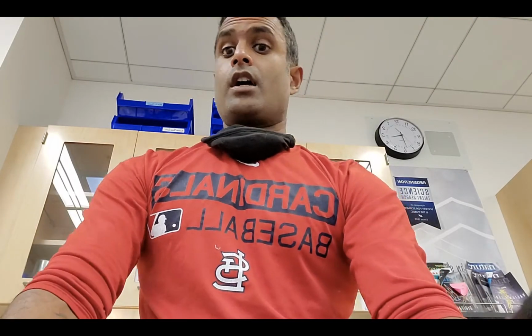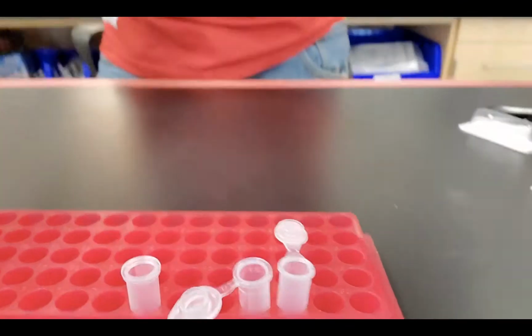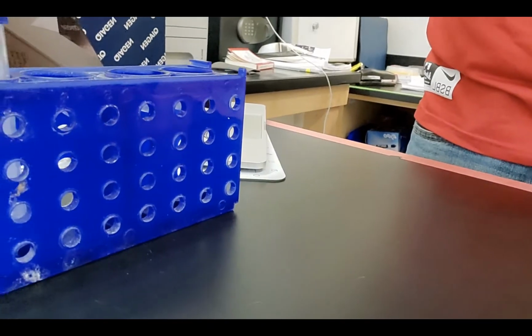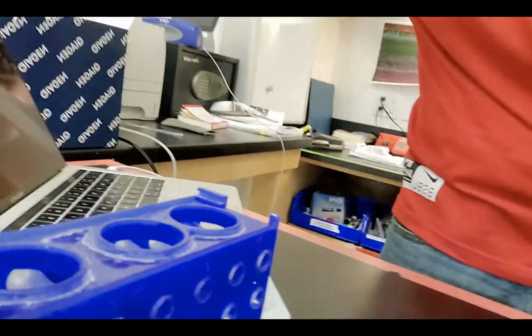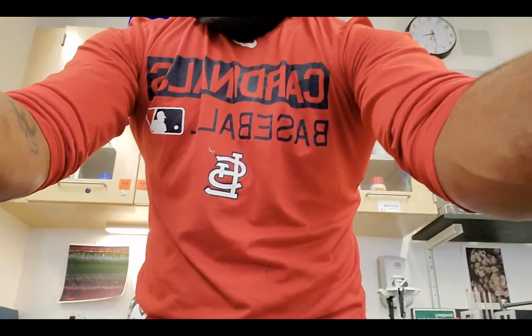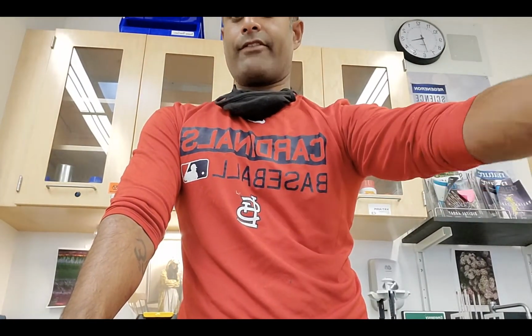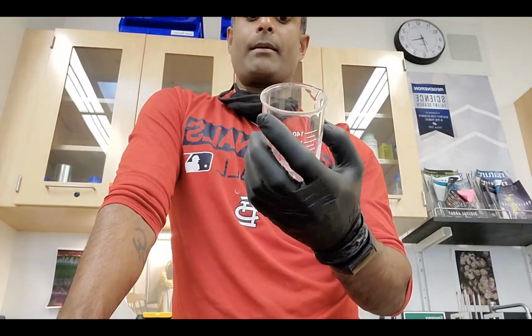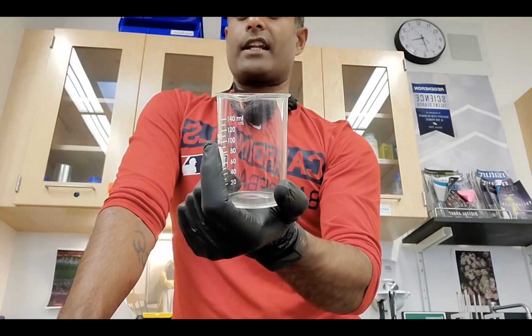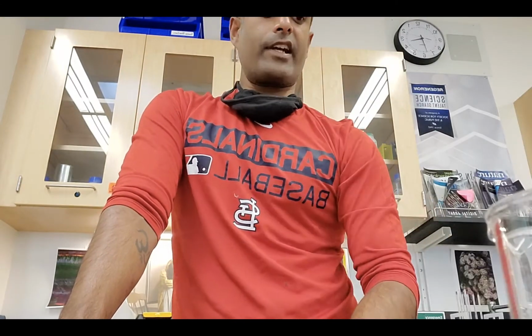Okay, so anytime I'm using test tubes of any sort, I'm going to make sure that I have a test tube rack. I don't ever want to leave test tubes on the table. All right, so since I'm going to be using tips and a micro pipette, I'm also going to make sure that I have what I call a dump beaker. This is just going to serve as my mini little trash can. I'm just going to stick that over there.